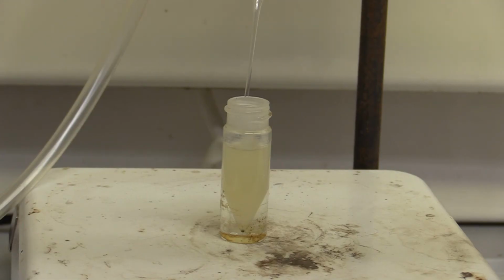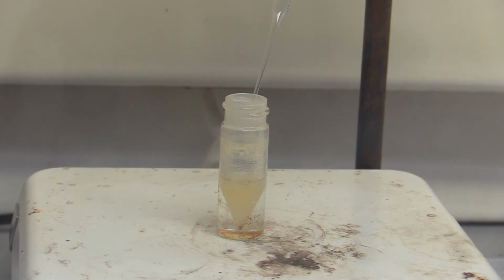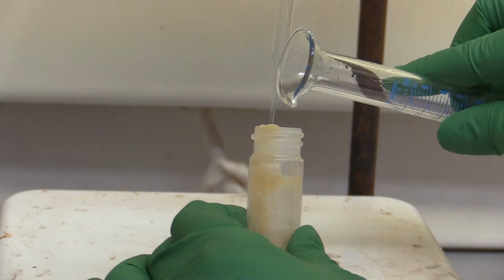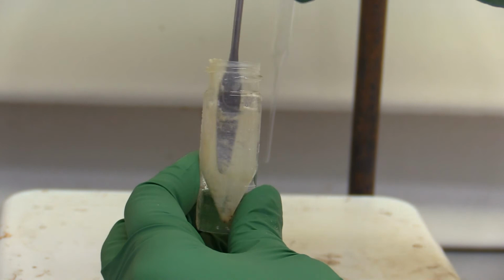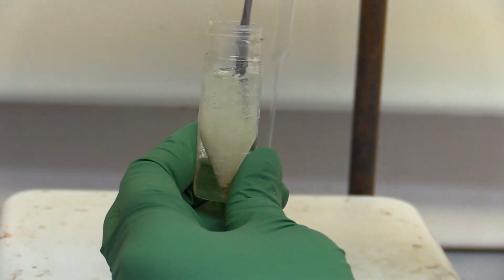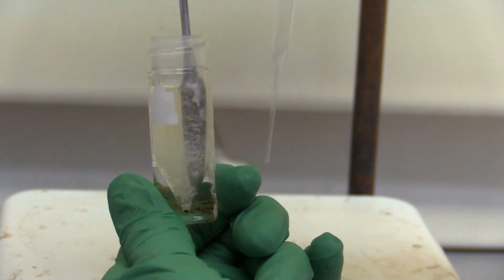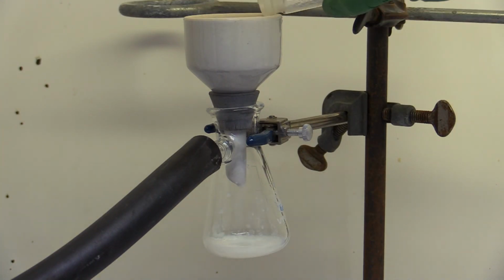Evaporate the dichloromethane using a slow airstream and gentle heating on the hot plate until an oily or solid residue remains. Add ethanol to the residue and triturate the solid with a microspatula. This can be done by pressing the solid against the sides for several minutes to remove impurities. Collect the solid by vacuum filtration, washed with ice-cold ethanol.